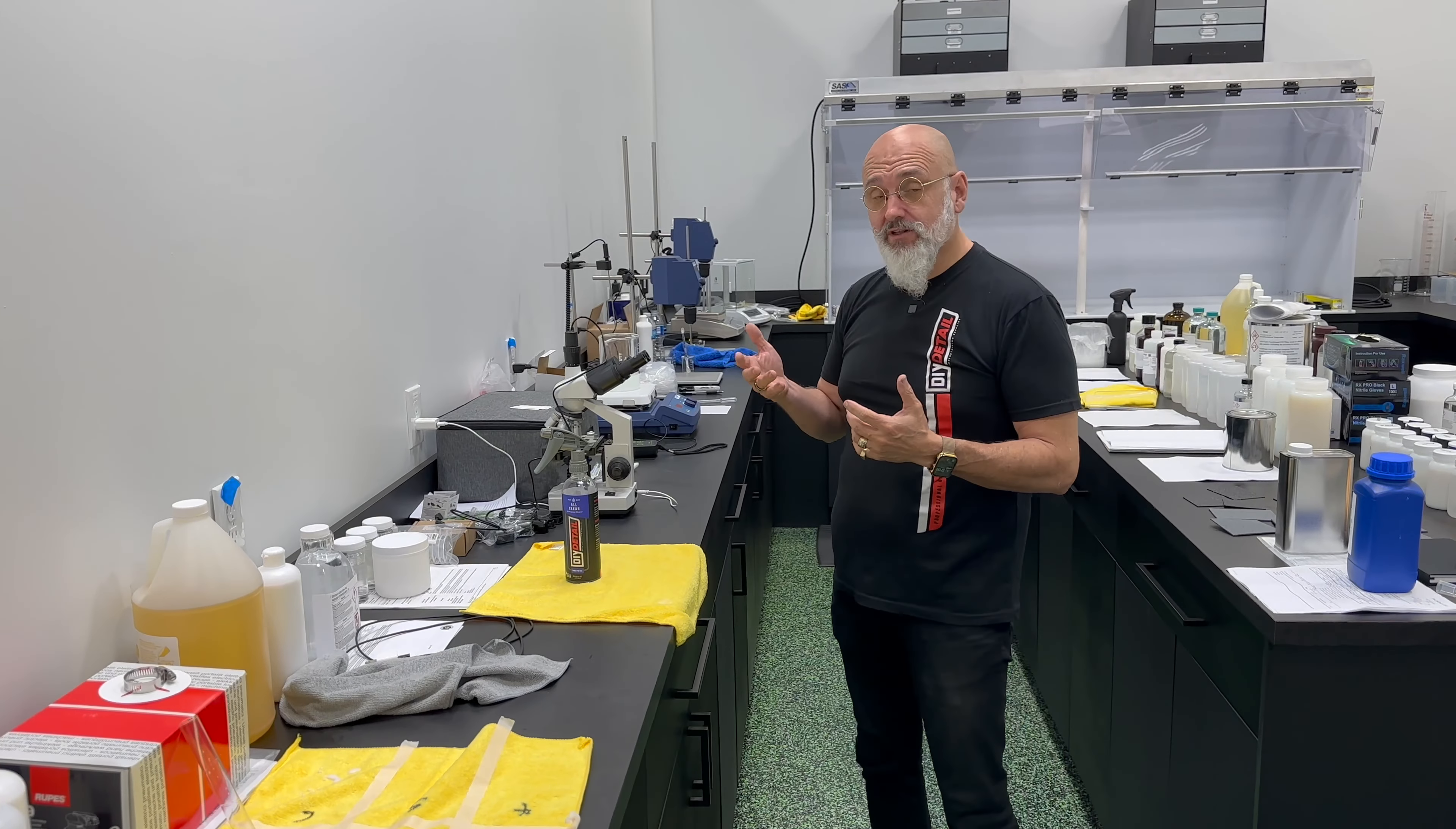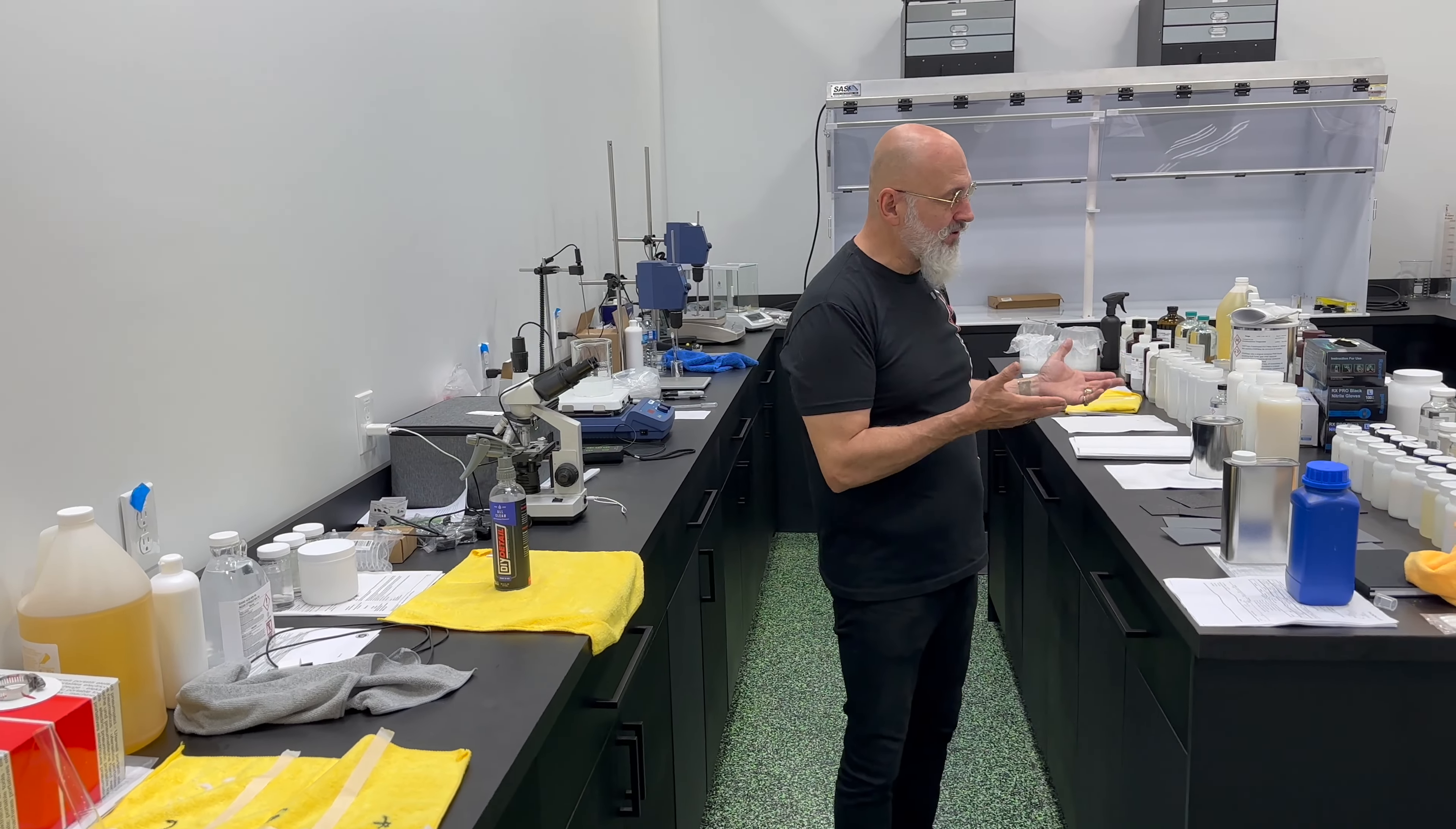Today we're going to show you a few things about a chemical development lab. This is the lab that we use, one of the labs, and as you can see, there's a lot of equipment and a lot of chemicals.